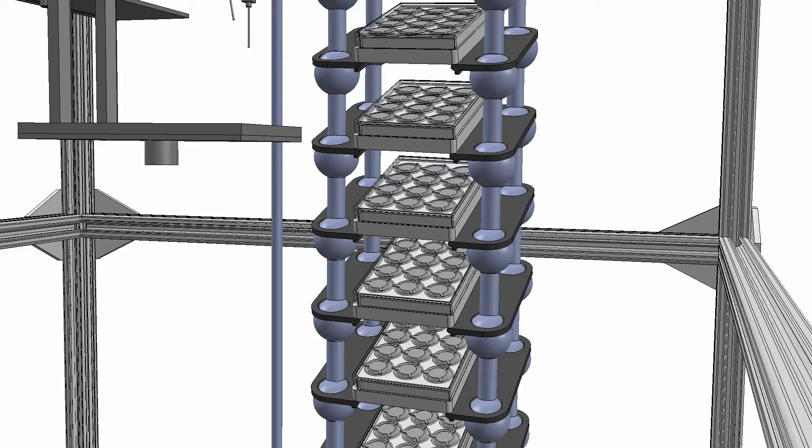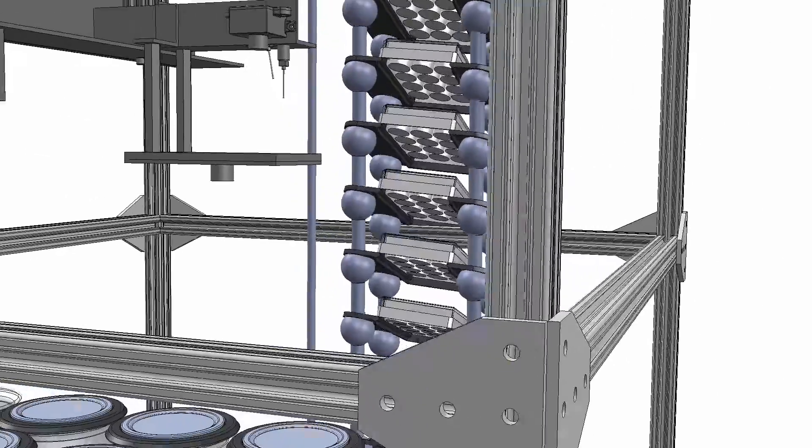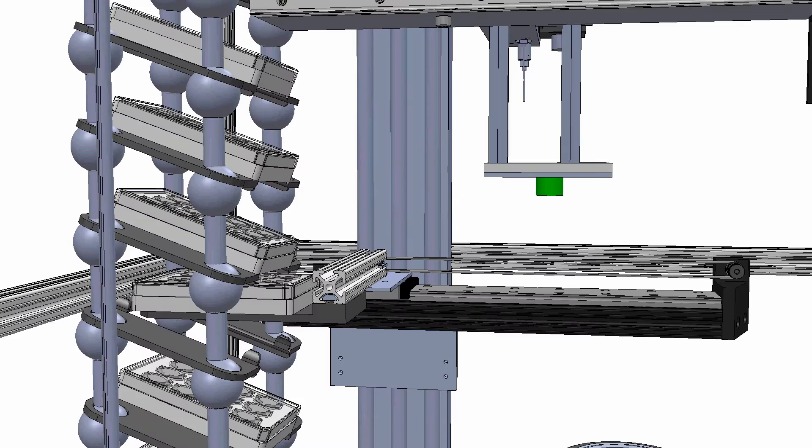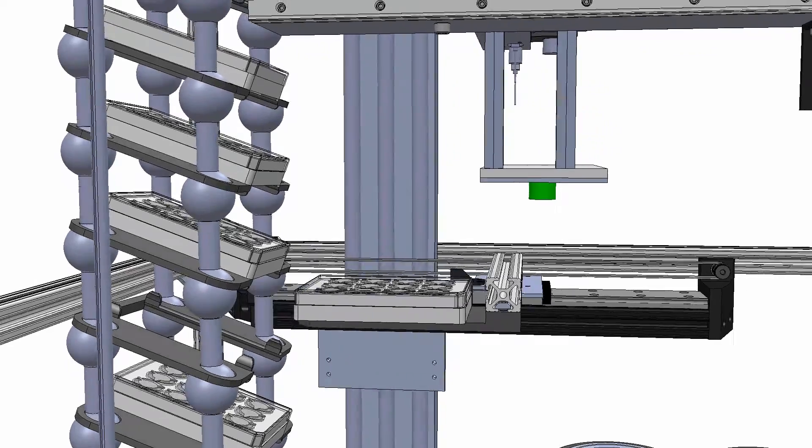Let's follow a typical cycle of this robot. The tower nutates the 10 well plates to keep the bacteria in suspension. The nutator momentarily stops while the arm lifts one well plate up and then out of the tower.